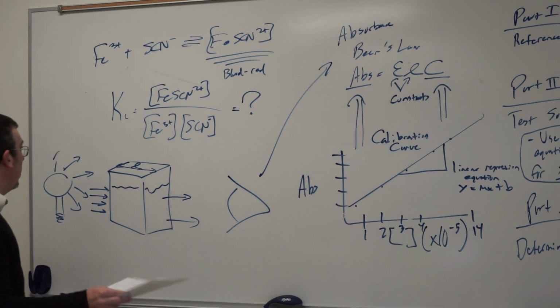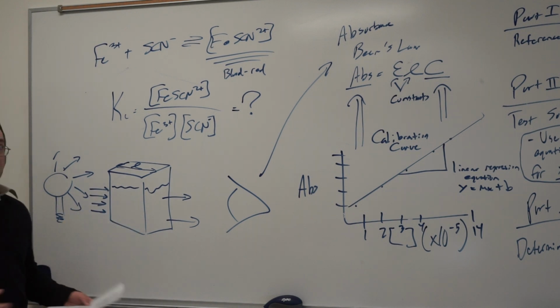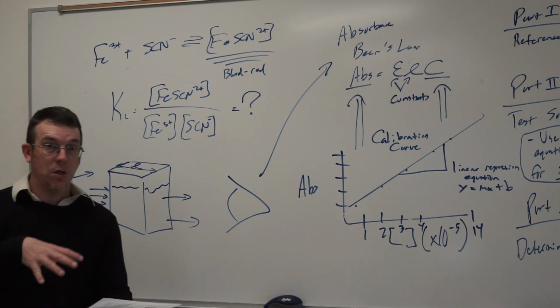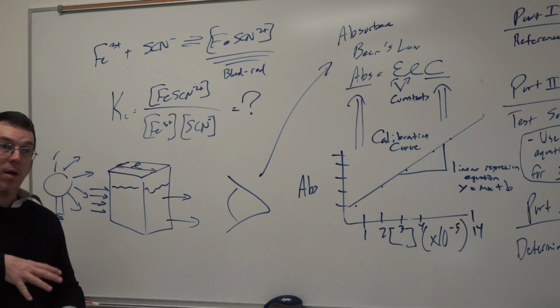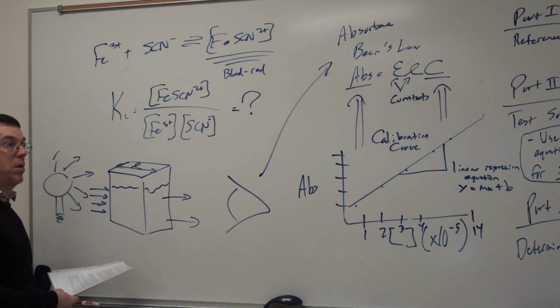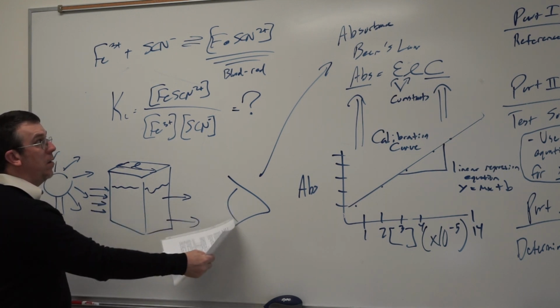In spectroscopy, what we do is we take a light and we pass this light through a solution. And so, as we all know, if you go to the restaurant and you get yourself a glass of sweet tea, it always comes out with ice. And so in the beginning of your meal, the color of your solution is really dark brown, but then by the end of the meal, a lot of that ice has melted, has diluted the solution, and now you have a lighter color. So as the light passes through the solution, that light will interact with what is in the solution, and so the concentration that you see is related to the absorbance that's detected on the other side.